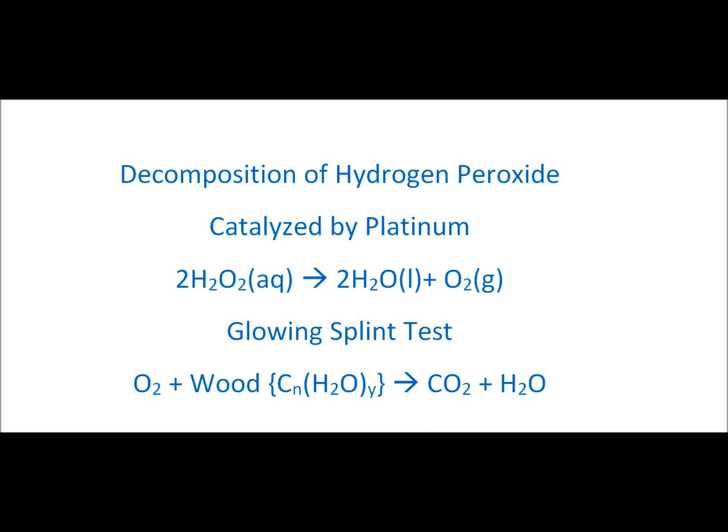Hello. I'm going to do a simple demonstration involving the decomposition of hydrogen peroxide catalyzed by platinum.